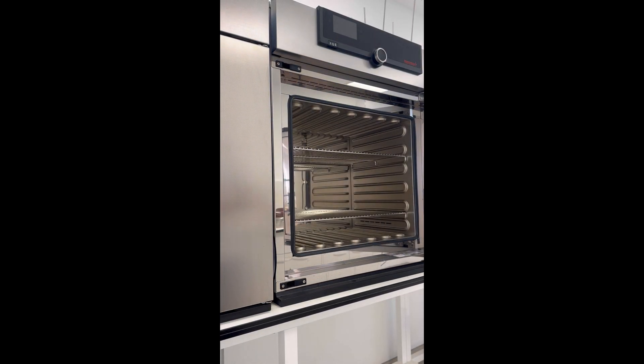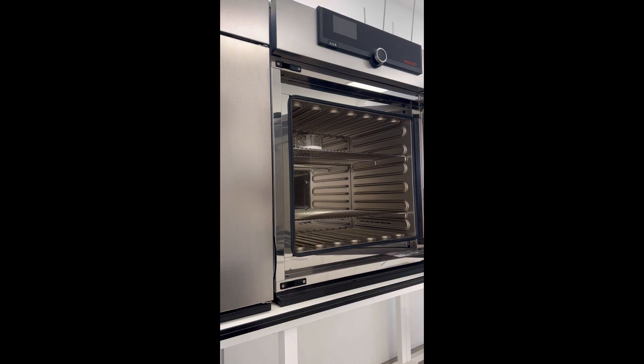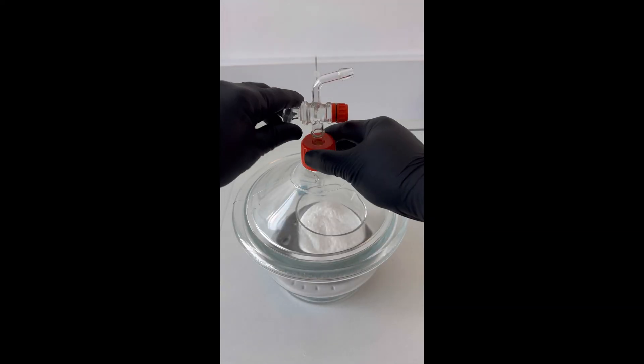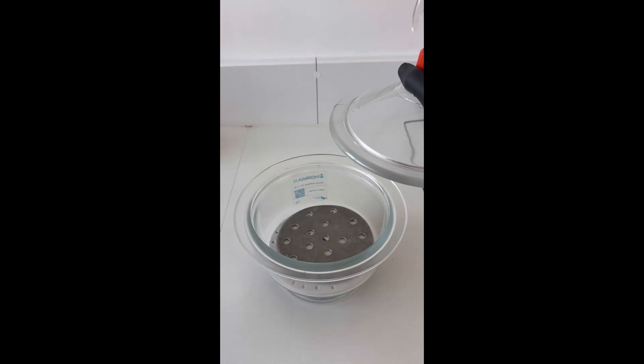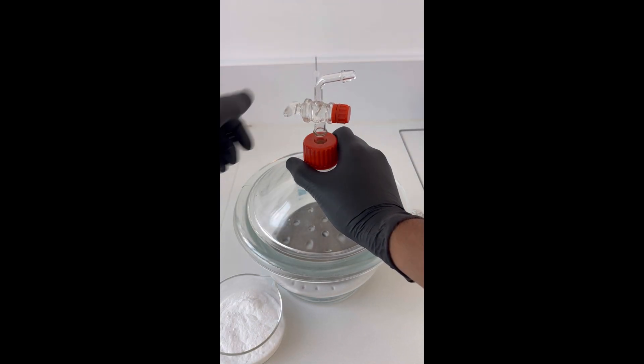We begin by drying the EDTA at 105 degrees Celsius for at least an hour. The powder is then cooled to room temperature in a desiccator to prevent absorbing moisture from the air.